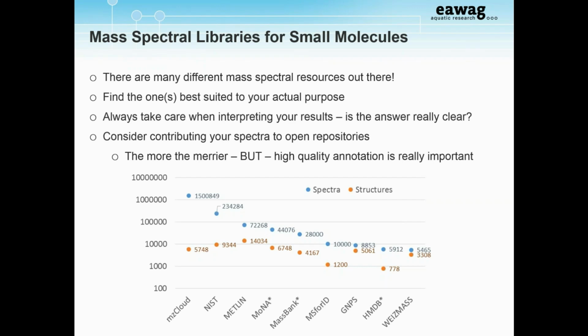And we've actually uploaded most of this to PredRet so that you can see for the different records what the retention time looks like for the overlapping substances. So there's about 4 or 5 different contributors that have added spectra via our MassBank, and these will all have retention time information, and some of the other ones as well.